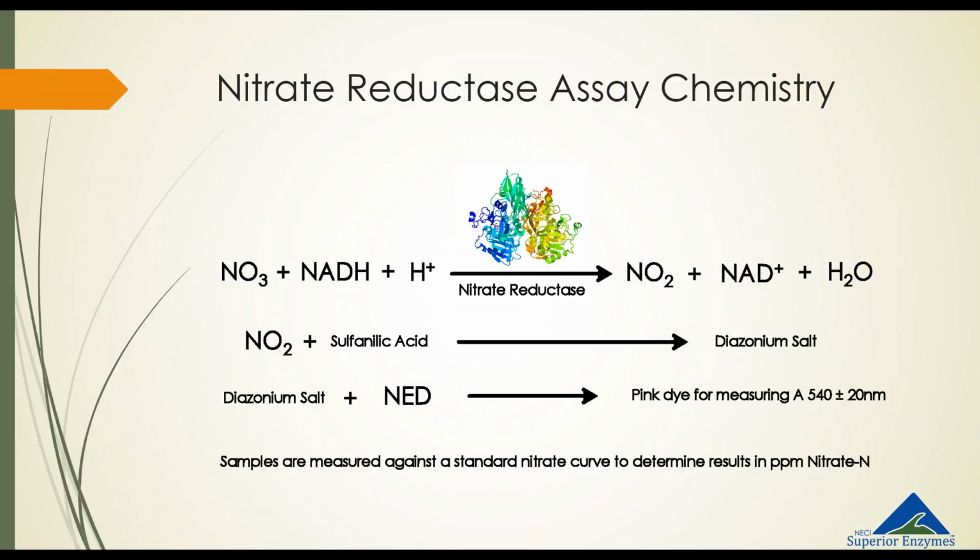We're just showing you the reaction for people who are interested in the chemistry. For the lab people involved, basically nitrate reductase replaces cadmium in the standard methods. It's after that everything's the same. And again, this is available on our website, and we'd be happy to provide more information about this.